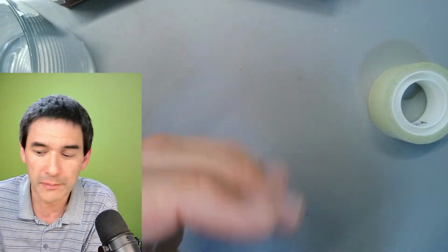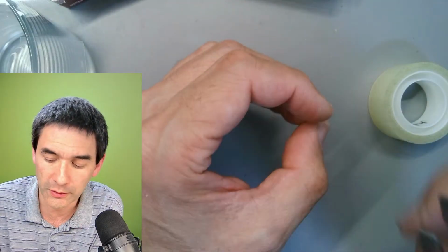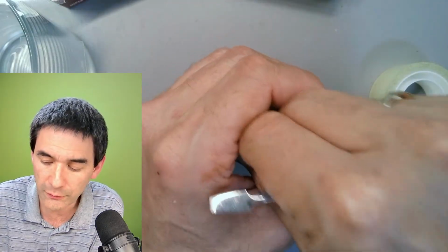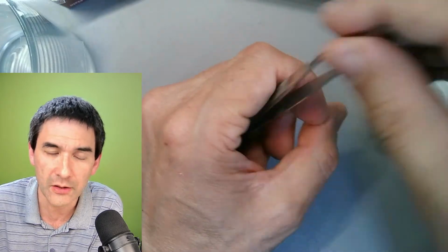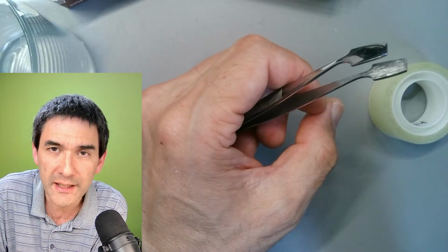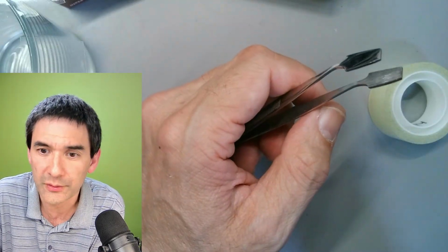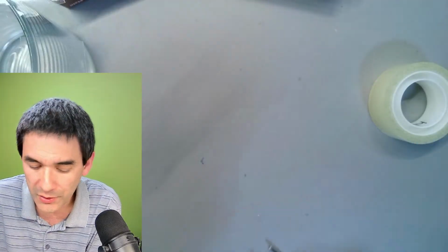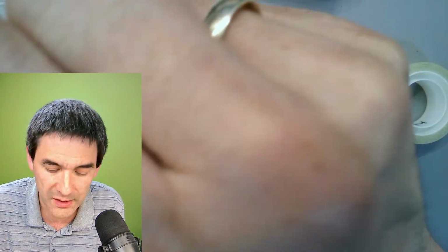I'm going to show you a little bit how this works. If this is the hair follicle, and in here you've got the face mite, by rotating the hair like this, you're squeezing the face mite out. The pressure squeezes it out. And now the next thing: once you've done this for a couple of seconds or a couple of minutes, you do the following.